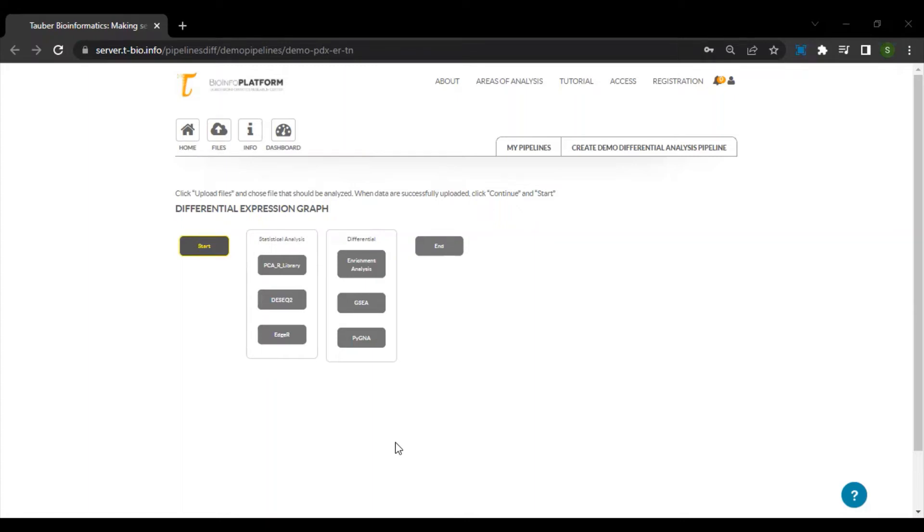In the previous lessons, we discussed how one can perform differentially expressed gene analysis at the end of a standard RNA-seq pipeline. In this video, we will learn how you can perform differential gene expression analysis separately.